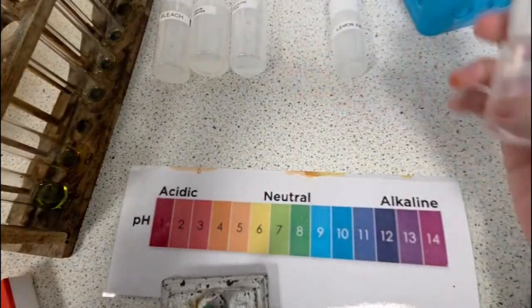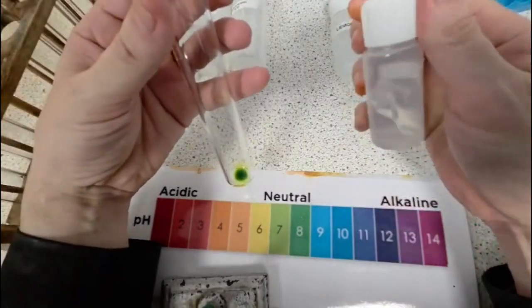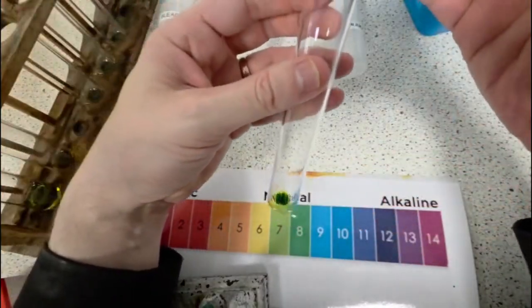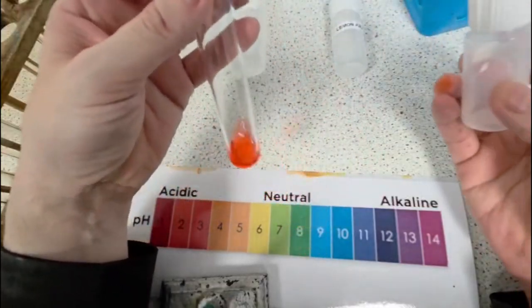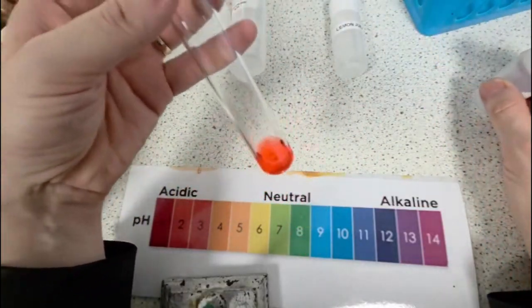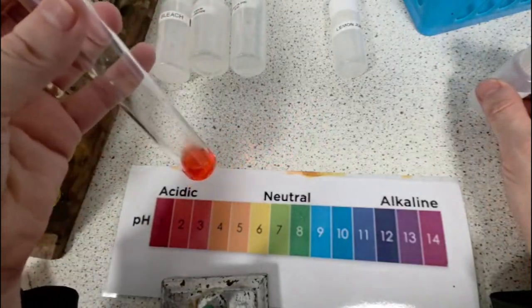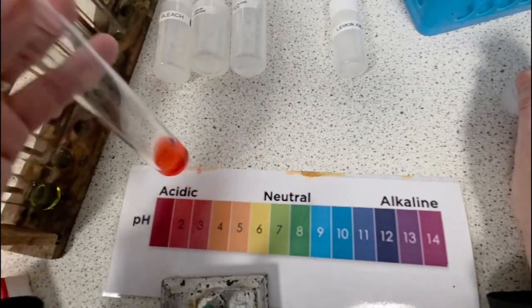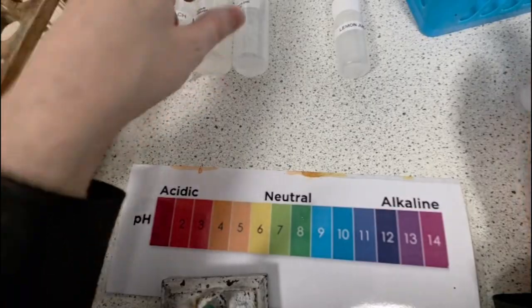We will test vinegar. Now, if you watched the last video about litmus indicator, you might have a prediction of what color this will turn, but let's find out. When I put vinegar into the test tube, straight away it turns a really bright, reddy orangey color. I'd say this is around maybe a 2 or a 3. We'll pop that in our rack and we'll move on to the next chemical.